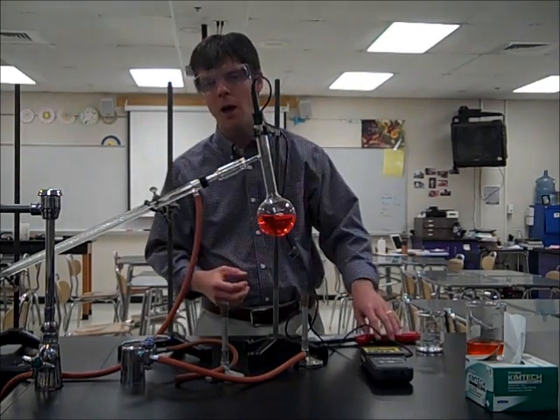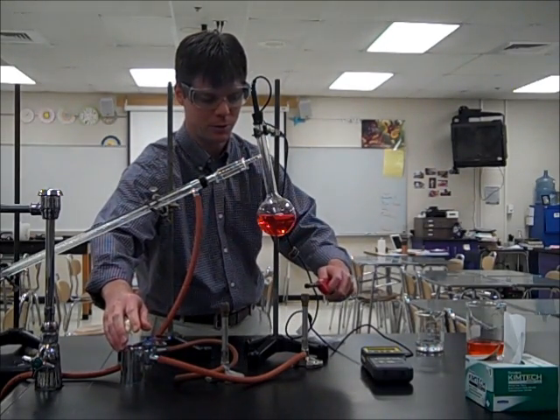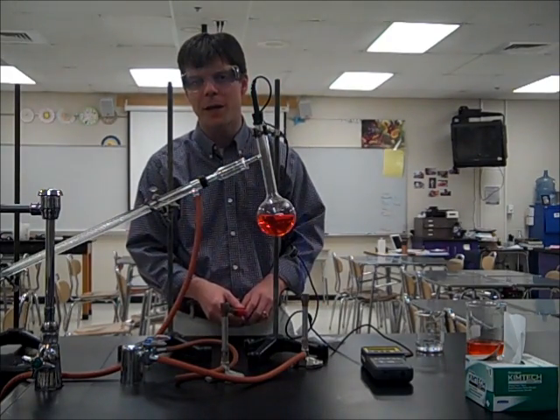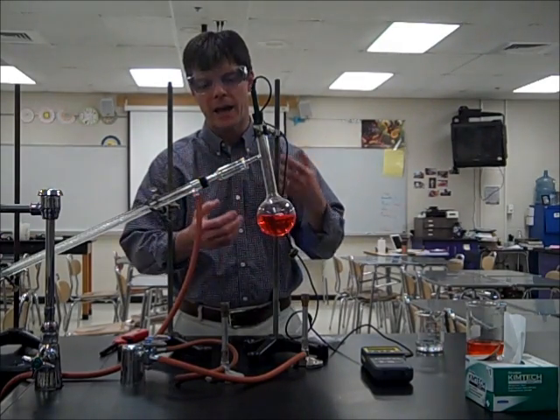What I need to do next is to turn on my Bunsen burner. So let's go ahead and do that. There we go. And I just want to adjust the flame on my Bunsen burner a bit to get a good flame, which is going to allow us to heat our solution of salt water and food coloring.